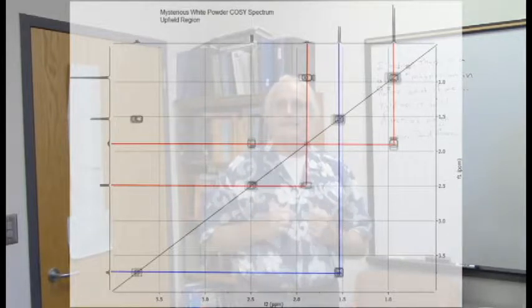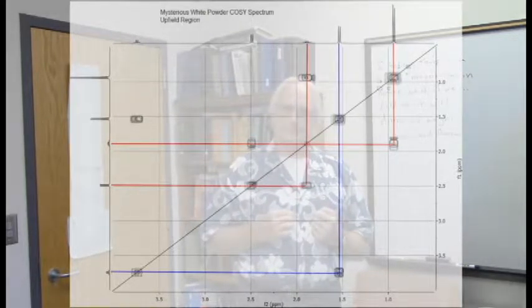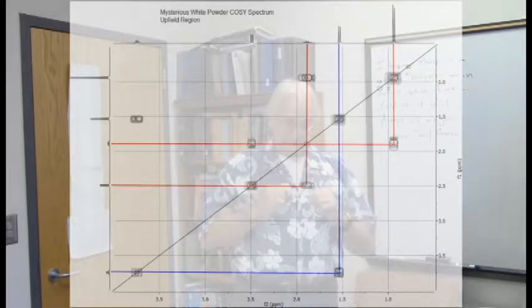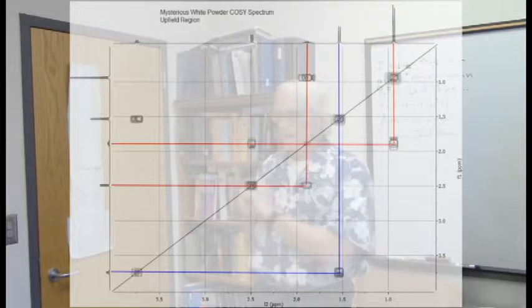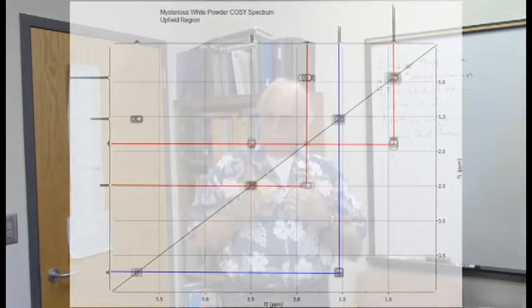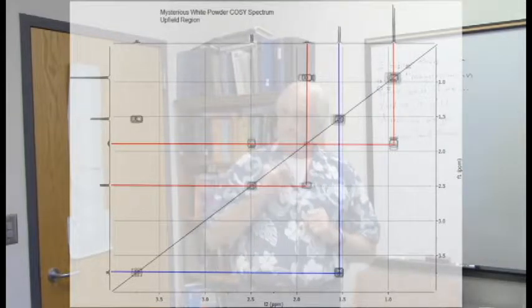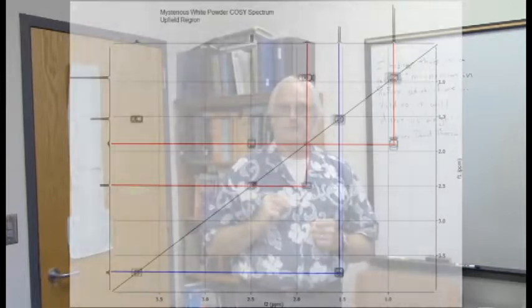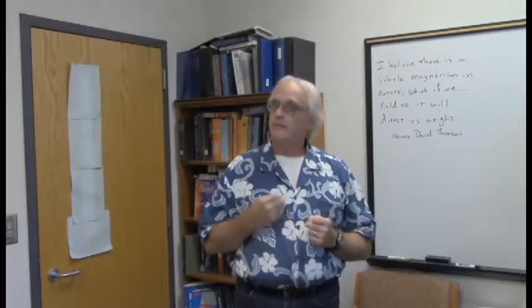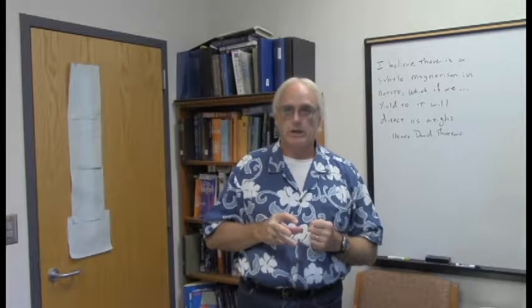And in fact, this is the last resonance we have not accounted for on the proton spectrum. Indeed, this CH group is a quartet. 3 neighboring hydrogens over here, quartet, no neighboring hydrogens over there. And in fact, the COSY indeed shows that there are no further crosspeaks. A second spin system, a simpler spin system, CH3CH.